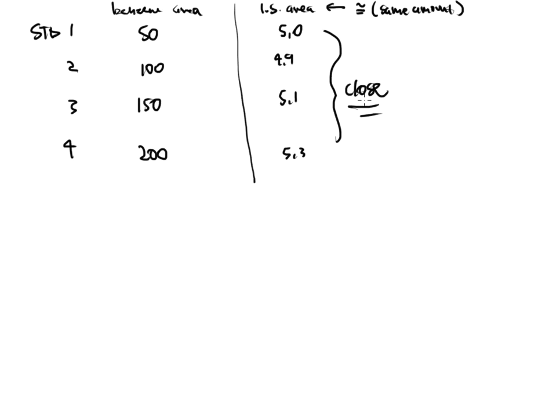So there's too many variables, too many variations that can happen. So they're going to be close, but they will not be exact. And this is one of the things that I look for. Because if they are not close, then that means one of these standards, well, too much of it was injected or too little of it was injected.